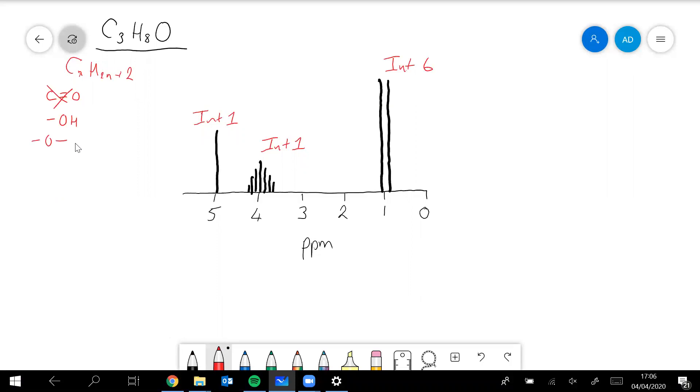I don't think it's that. What makes me think it is an alcohol is that we have got this proton would give a peak of integrated value one, and that's there.